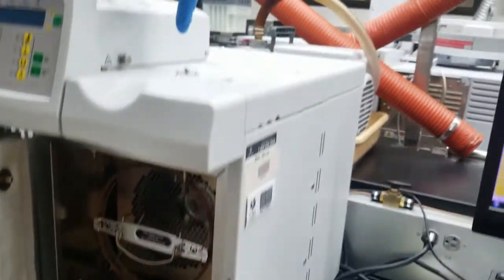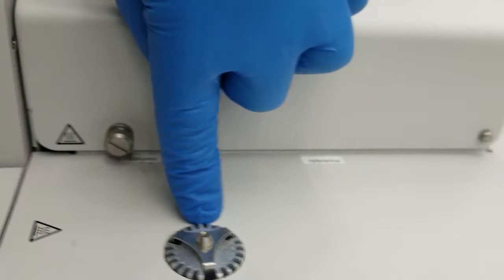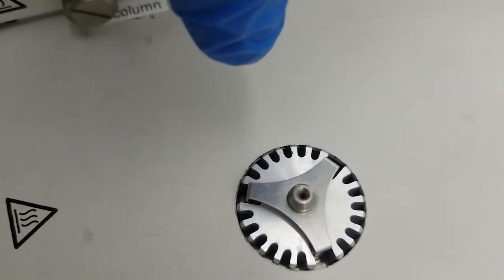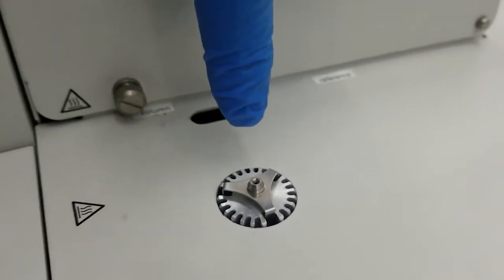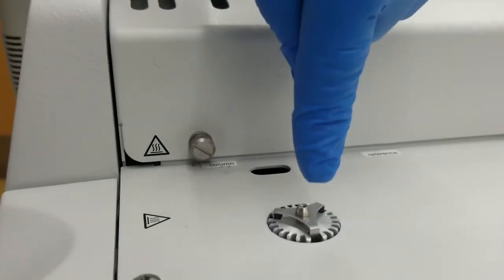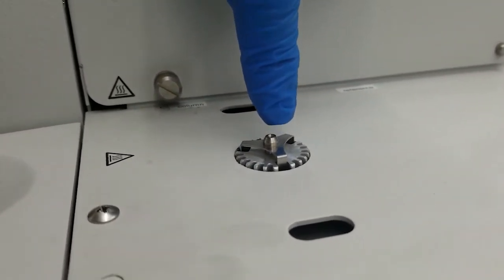At the top of the gas chromatograph, there's the injector port. This injector port is kept hot so that the sample vaporizes as soon as the needle is injected, and the needle goes in through a very narrow opening through a, what do you call it? Septum. Septum, thank you. The rubber septum keeps a seal so that the carrier gas doesn't leak out. You have to push the plunger all the way down, or the needle down inside, and then this little raised piece here is the trigger that tells the instrument to start the run.